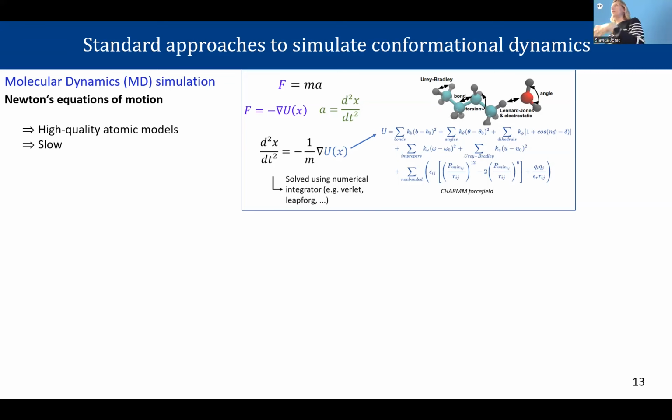So you have deterministic trajectories for the atomic positions and for the velocities of each atom. Those Newton equations come from these equations here, where U is the potential energy function that is here modeled using CHARMM. This is the jargon in the field of MD simulation.